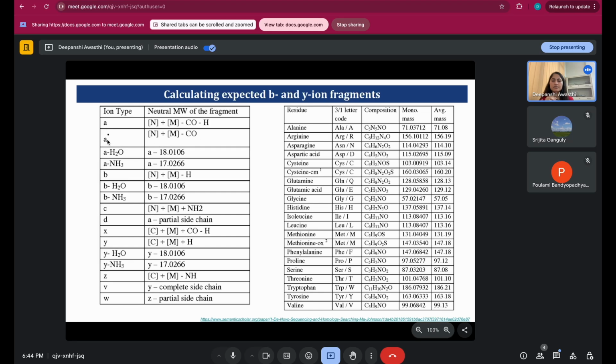So in that way these ions are generated. This is just to show you that whenever you generate ions, those ions contain some extra charges and some extra atoms attached to them, not just the residues only. Due to which these ions will have some extra molecular mass attached to them. So to identify the residue mass, we have to subtract the mass of the attachments.